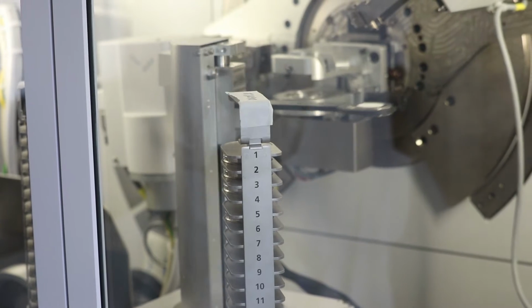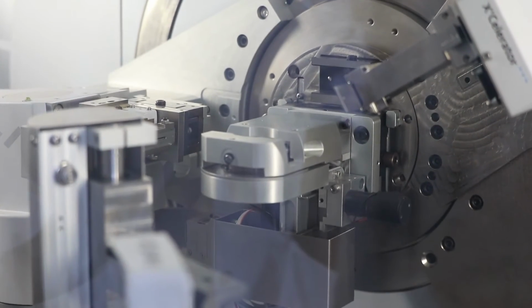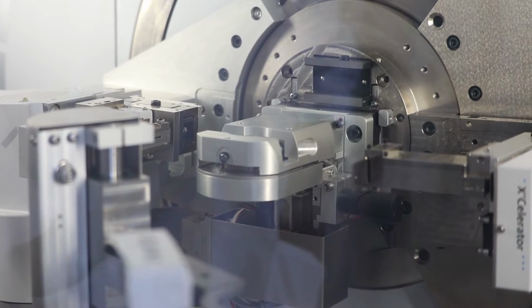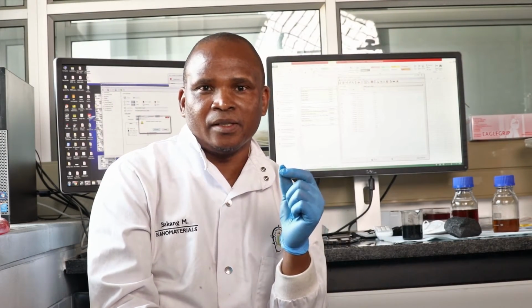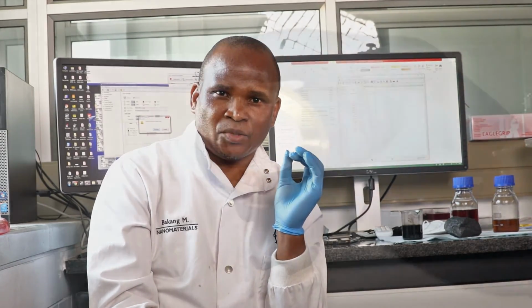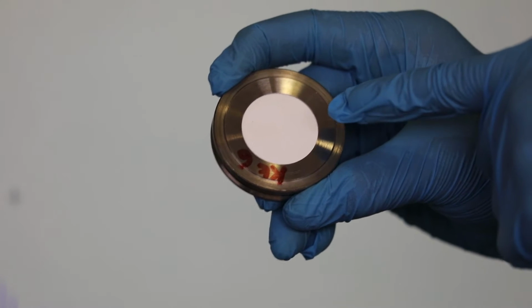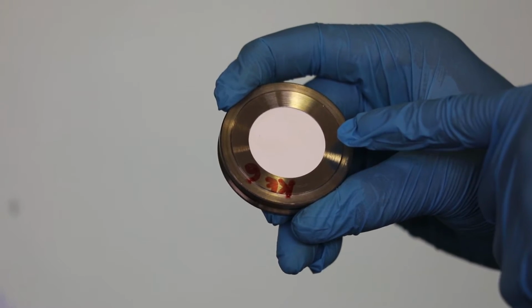And then the XRD is a little bit different because elements combine to form crystals. And because a crystal structure is unique in its own form, it's more like a fingerprint. We direct the X-rays into the mineral, and then it actually reveals the fingerprint of the mineral, which we call the XRD pattern.